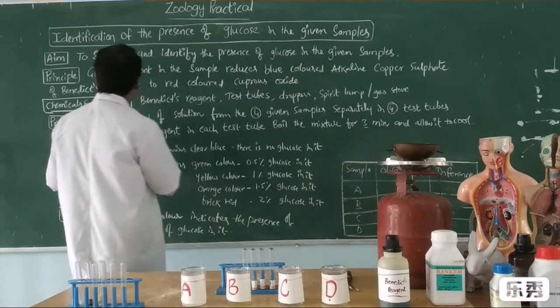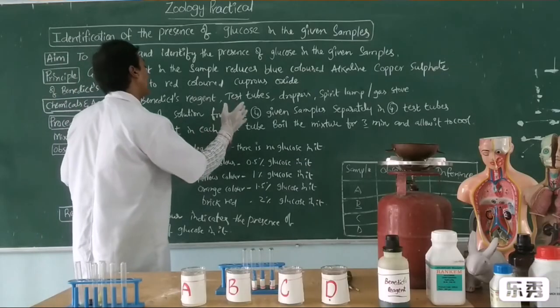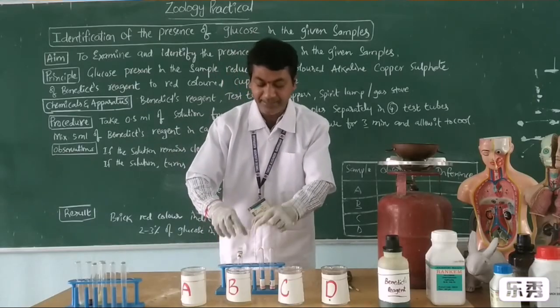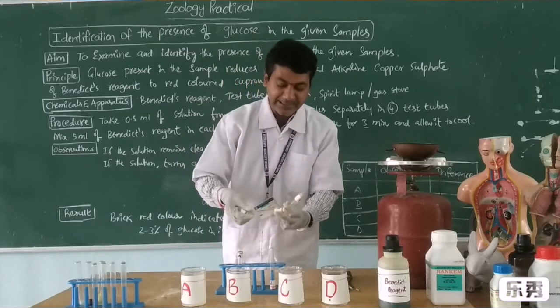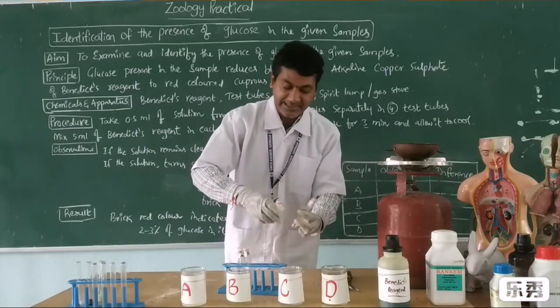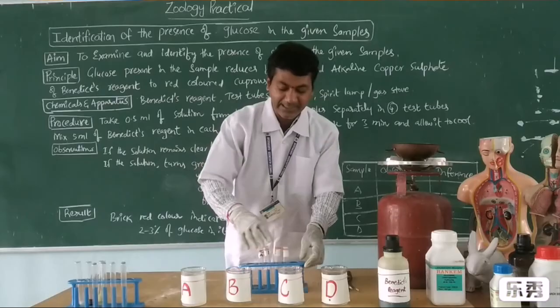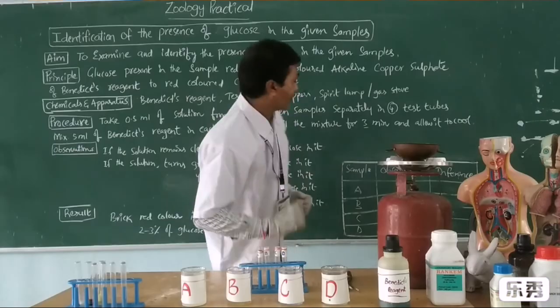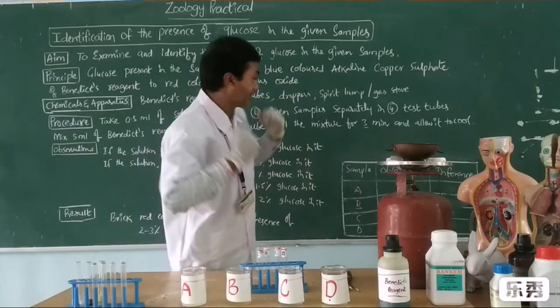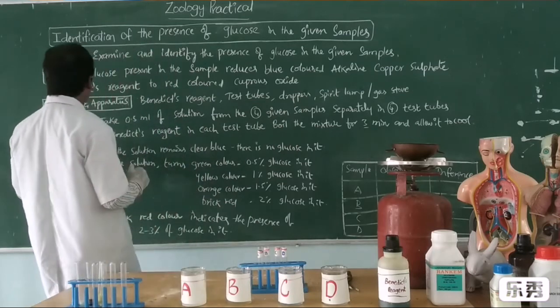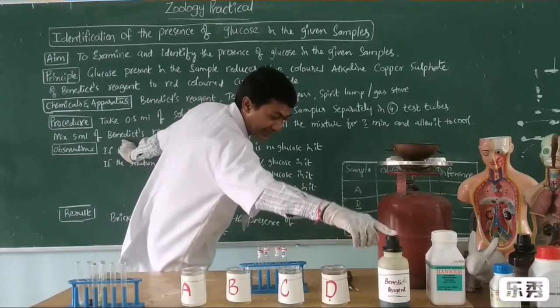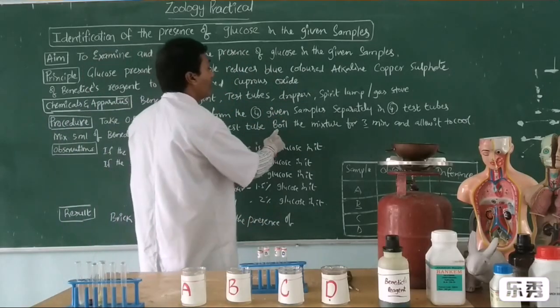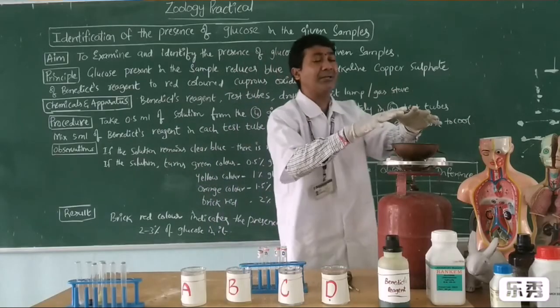Procedure: take 0.5 ml of solution from the four different samples separately into four test tubes. I am labeling them A, B, C, and D. Then mix 5 ml of Benedict reagent — this is the Benedict reagent — add 5 ml into each test tube. Then boil these test tubes for 3 minutes and allow them to cool.